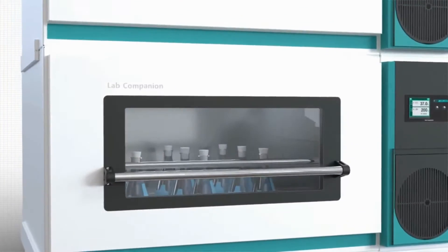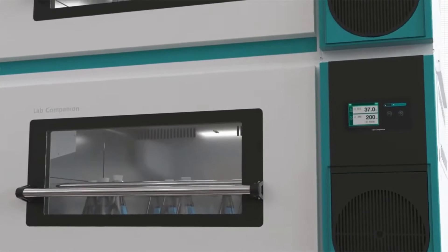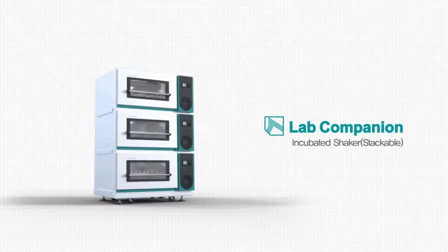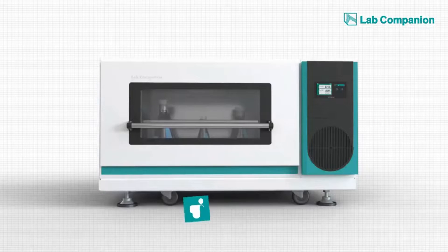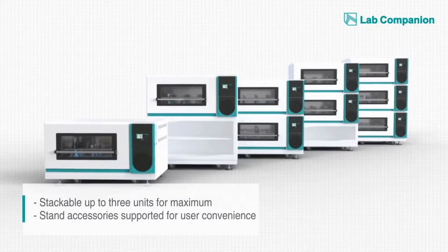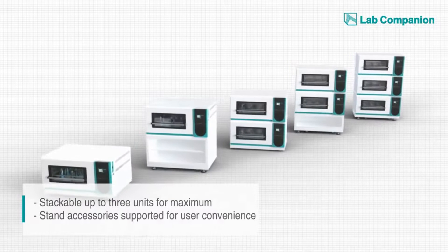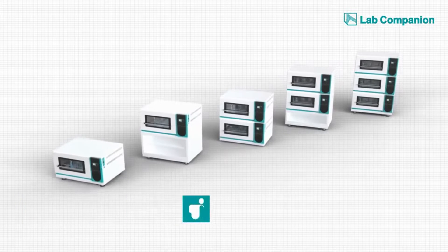Lab Companion considered user convenience as the top priority when we designed the stackable incubated shaker, and as a result you can maximize your optimal space efficiency and control precision. Lab Companion's stackable incubated shaker can stack up to three levels if your experiment requires, and comes with standard accessories that you can use to build the most optimal design.